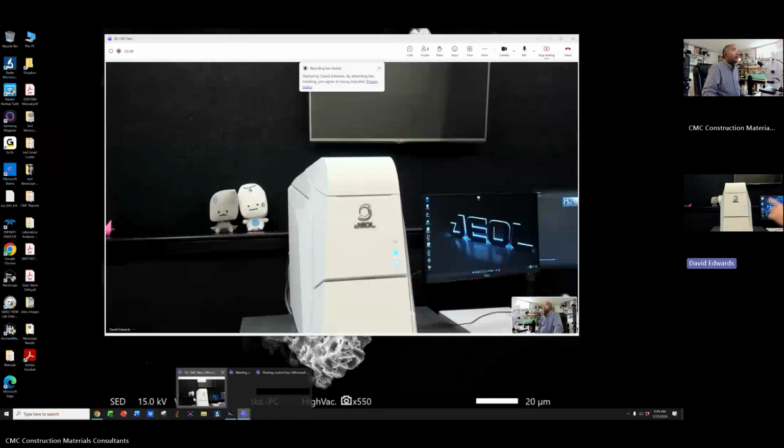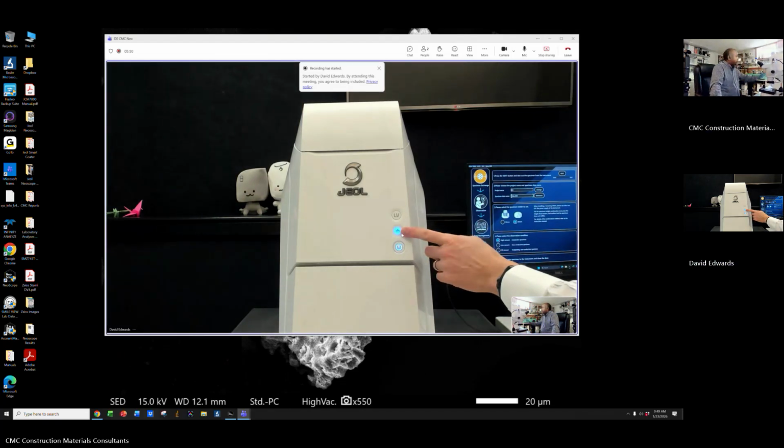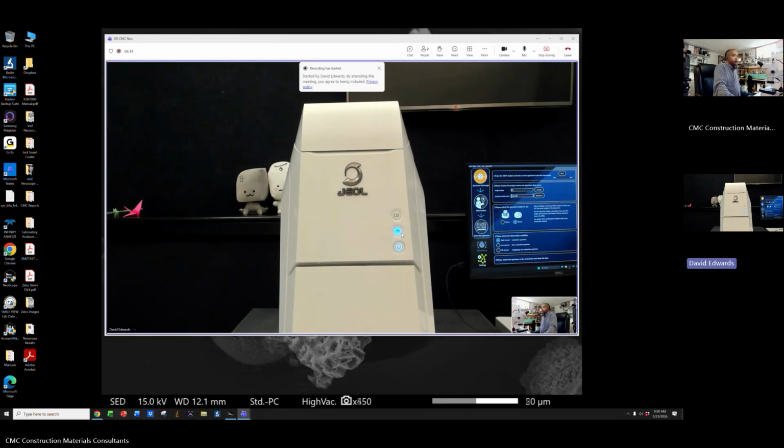You have 3 buttons on the front of it, so the middle one. Oh, the middle one. Oh, it's blinking now because it's venting. Yep, that's the one. So you want to press it now while it is blinking? Yep. Press and hold it for a second. Okay. It's basically going to open it again, right? Right. As soon as it vents and opens, then you should be all set.